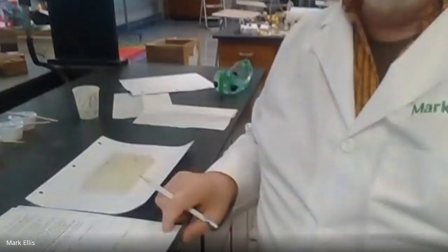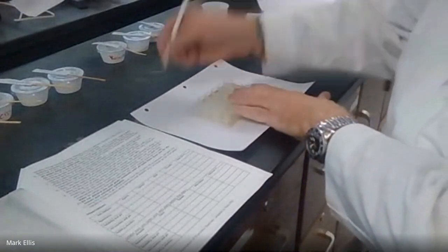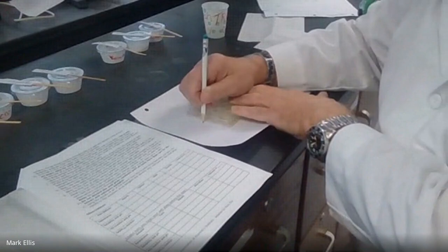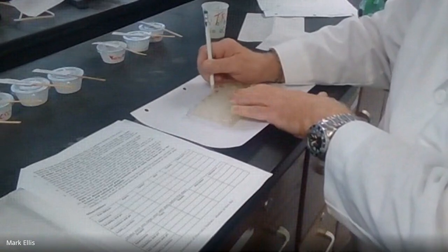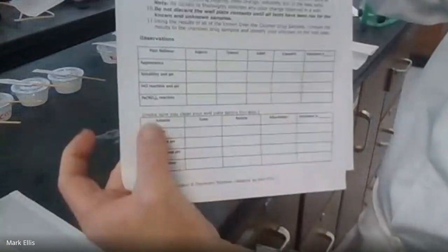I did one for the pain relievers. This is for the antacids. So first thing I do is I just mark the corner, and then I'm going to mark the line between each well. Even though I don't use them all, I can mark them real fast. And then using this chart here, I'm going to label those lines.